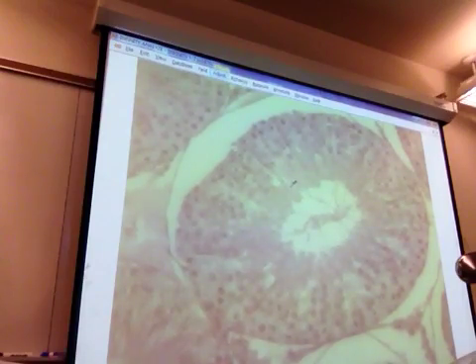The other way you can find nurse cells is that if you've got the spermatids up here, you can see more of their nuclei than what this cut is. You can look for gaps in between the spermatid nuclei at the top, and then follow that down. But what you're looking for is a nucleus that's kind of fat or kind of smashed up in here. And you want to be able to follow the cytoplasm from the bottom to the top. So like this would be one, and then you can kind of go like this, and like that, to the top, and then you can go back down.